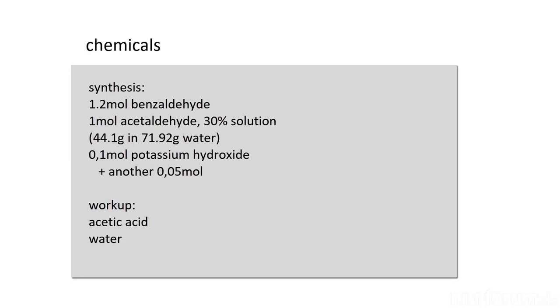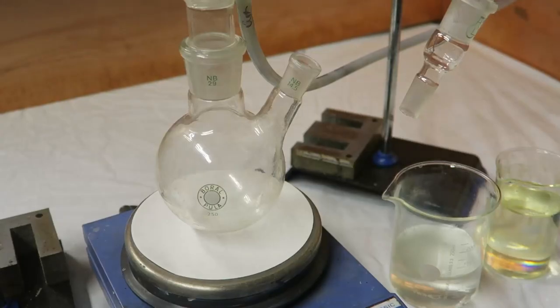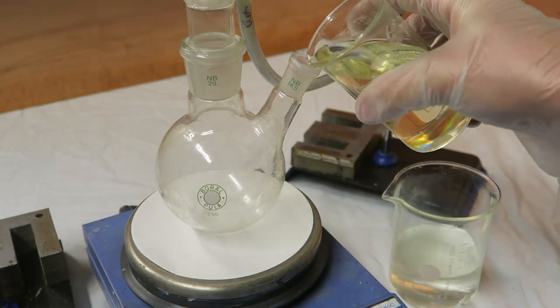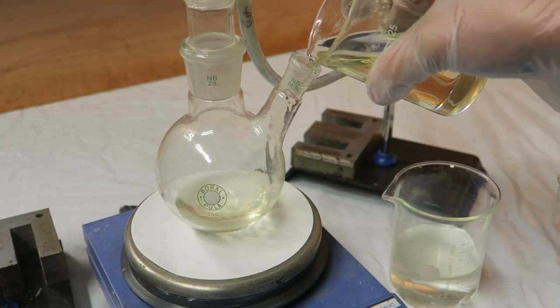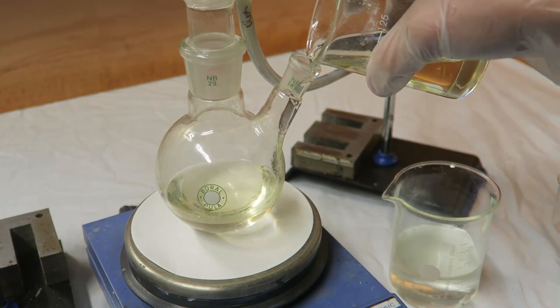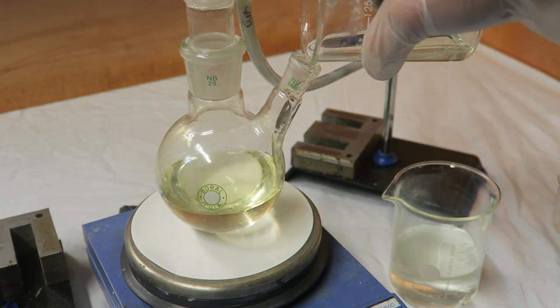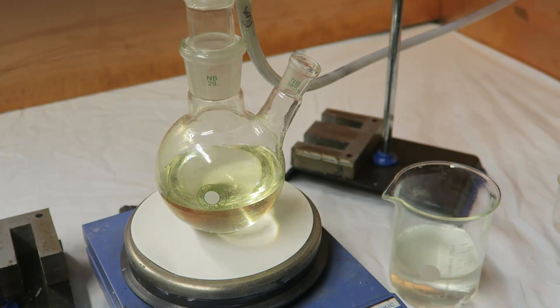Also, some potassium hydroxide is dissolved in water and added as a catalyst. All of the benzaldehyde is added to a two-necked round-bottom flask with a condenser on top. You can see that my benzaldehyde is already contaminated with benzoic acid due to oxidation.